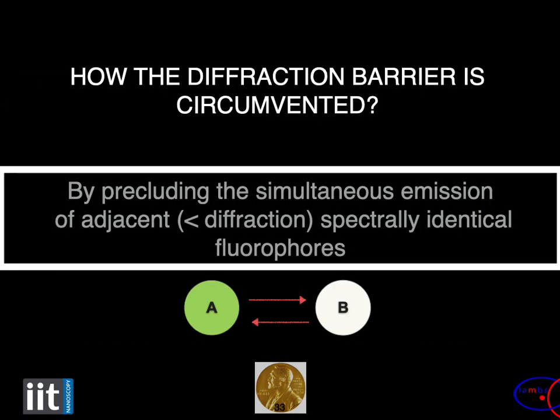And a very simple idea. It's not a matter of winning against diffraction, you cannot. How can you circumvent it? Well, in a very simple way, by precluding the simultaneous emission of adjacent spectrally identical fluorophores.